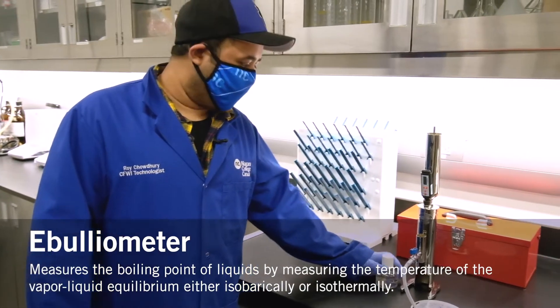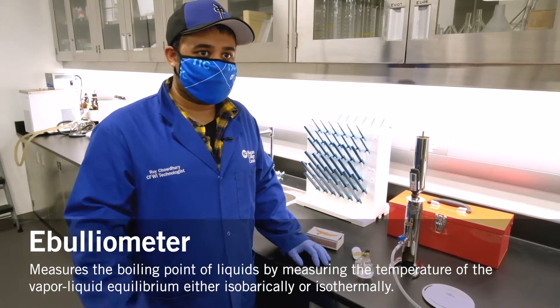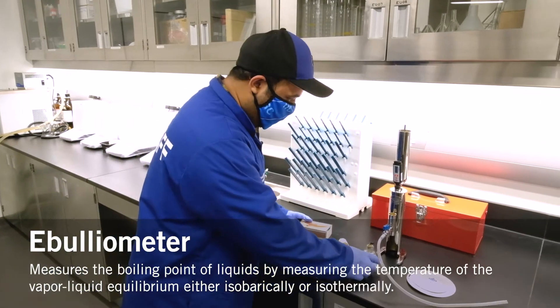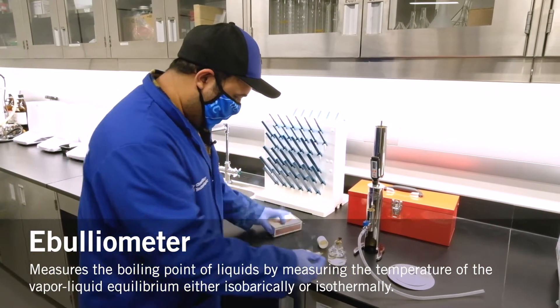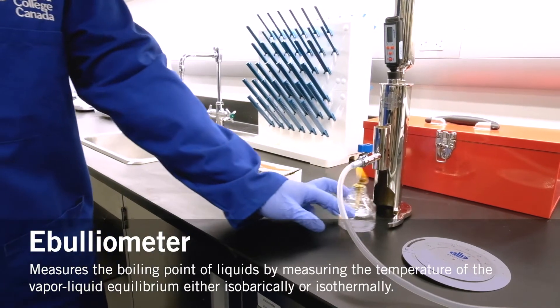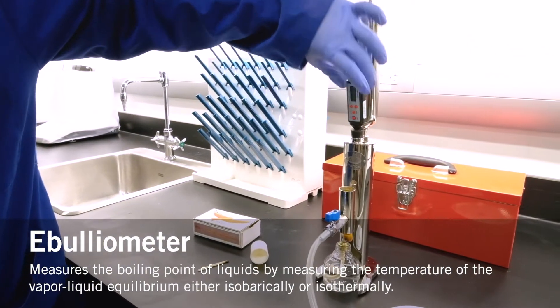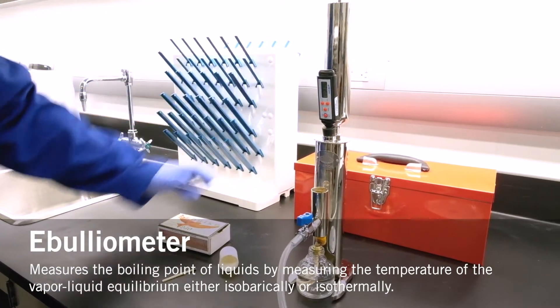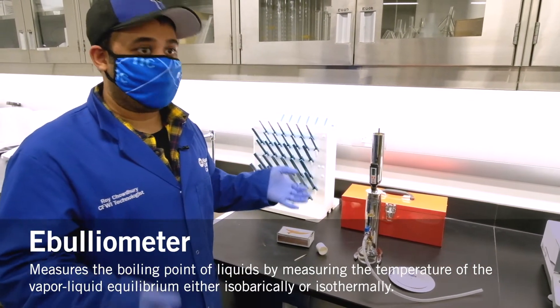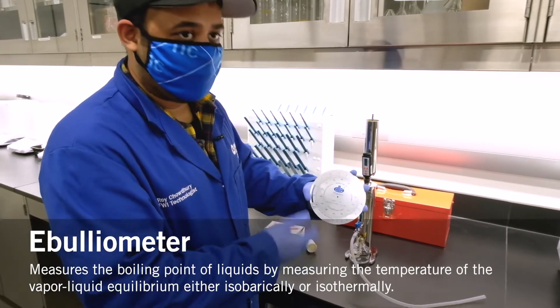This is an ebuliometer. It gives you the alcohol percentage of a sample — for example, wine. This is used mainly by the wine students. How it works is by lighting the flame, and once the sample is placed in there it heats up. The thermometer gives a temperature reading to ensure it's at the boiling point. It compares the boiling point of water to the boiling point of the sample and gives you an alcohol reading based on that. After it's done boiling, you compare it with the chart here to determine the alcohol content present in the sample being tested.